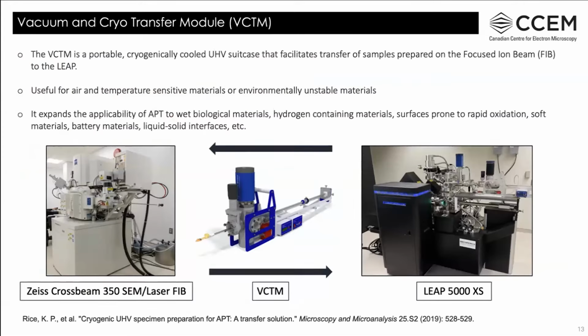With the instrument upgrade last summer, we also purchased a vacuum and cryo transfer module, or the VCTM, which is a portable suitcase that attaches onto the LEAP 5000 XS and the Zeiss Crossbeam laser FIB and facilitates transfer of samples between these instruments without exposing them to the ambient.